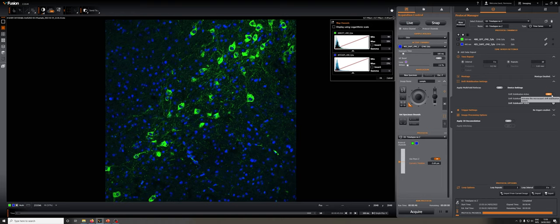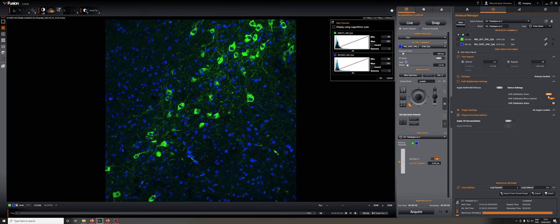For water objectives, there are two reflections, one between the water and the cover glass, the other between the cover glass and the imaging media. The former is typically a bit stronger, and the system can use it to compensate.